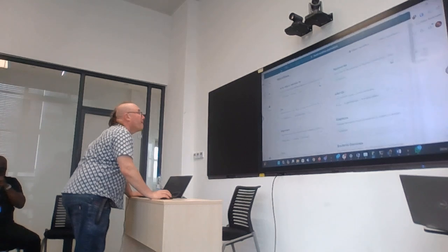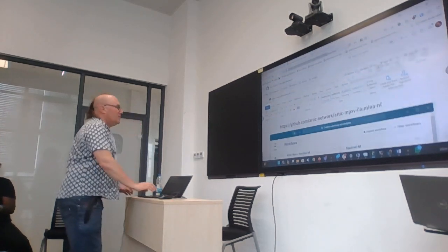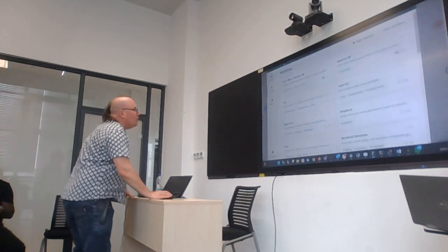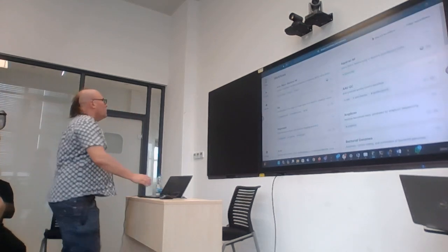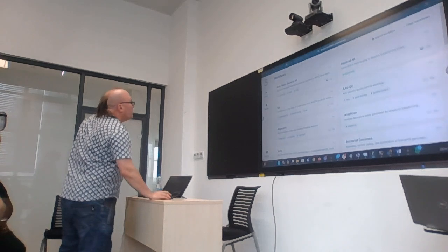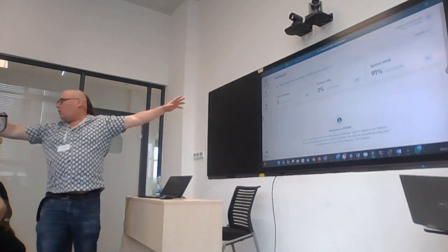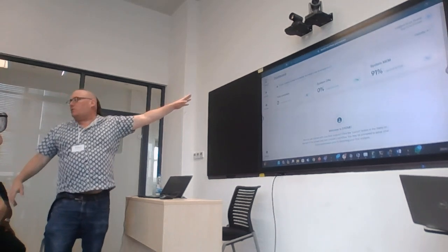But I've sent it to them via WhatsApp. Okay, so that link over there. If you're using Epi2Me, when you start with Epi2Me, the first screen you see is this screen. Not you guys with the 5.1, but everybody else.